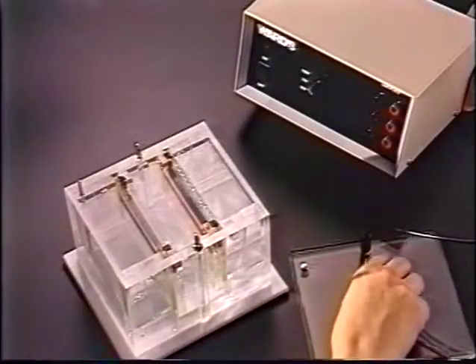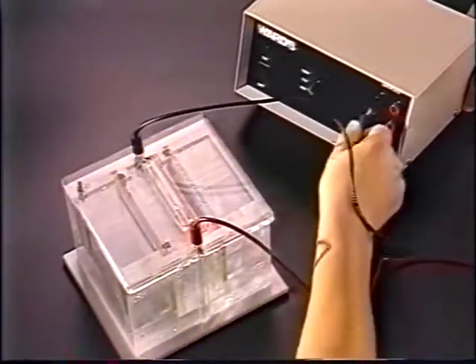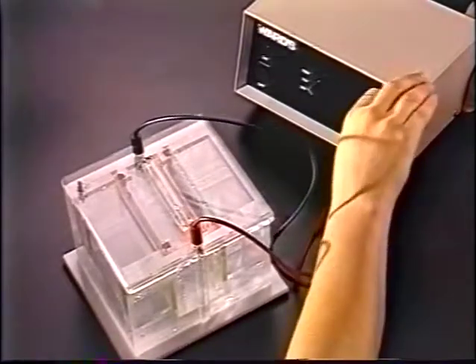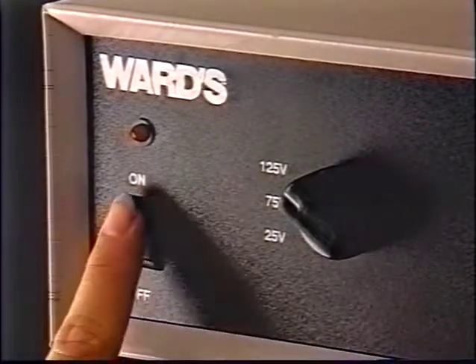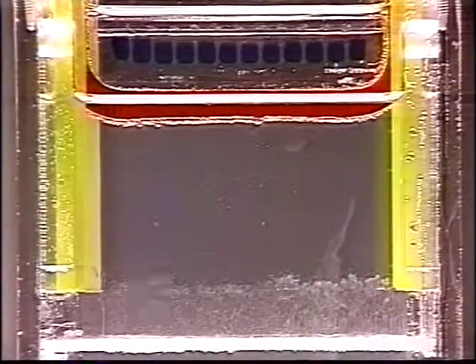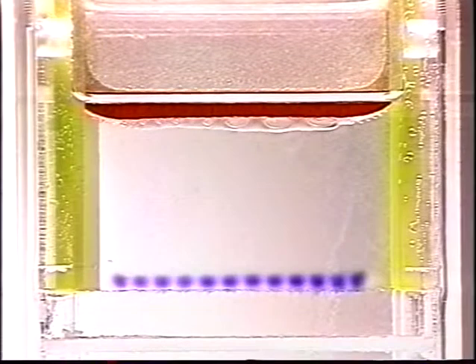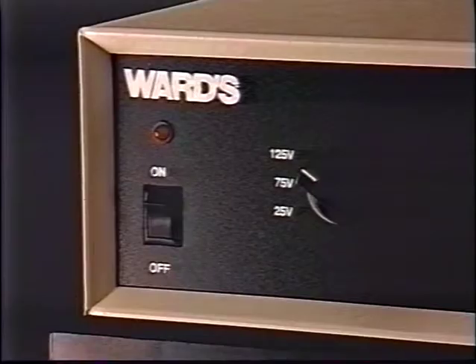Make sure all connections are dry. Attach the lid to the chamber, making sure it is aligned properly. Plug the patch cords into the power supply. Set the voltage to 125 volts and turn on the unit. When the power is turned on, gas bubbles will begin forming along the platinum electrodes. When the tracking dye is about 2 millimeters from the end of the gel cassette, turn off the power.